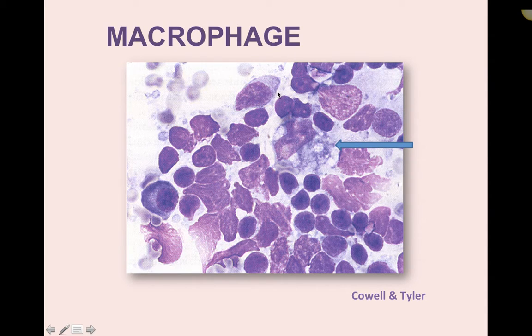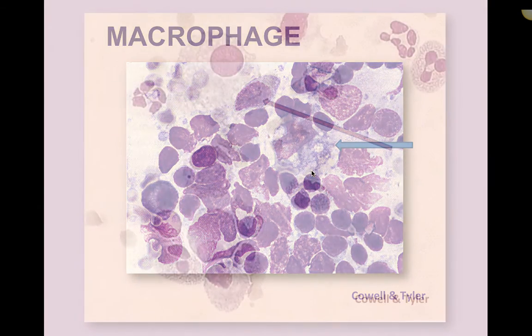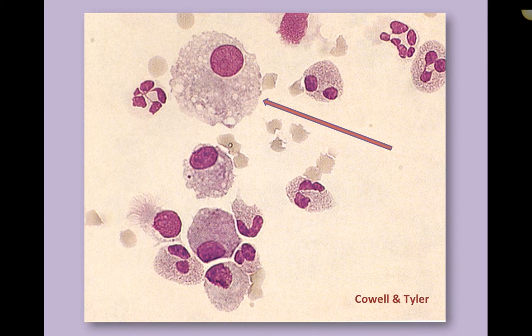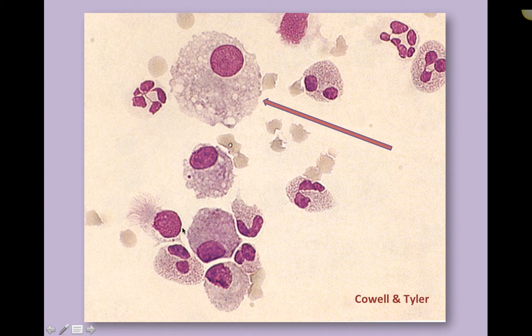Here is a beautiful macrophage. These are small lymphocytes, a plasma cell with that perinuclear clearing around the nucleus, and then another macrophage. This is a macrophage specific to the respiratory system — the shape and size you'd see in mucus. And here is a neutrophil.